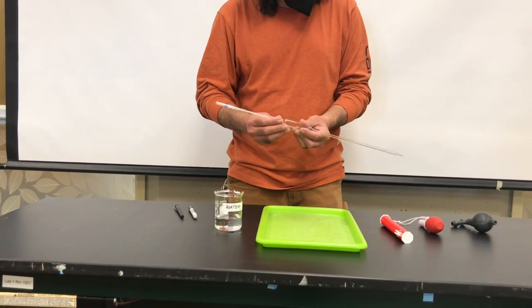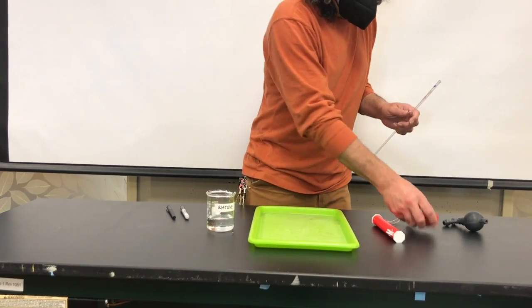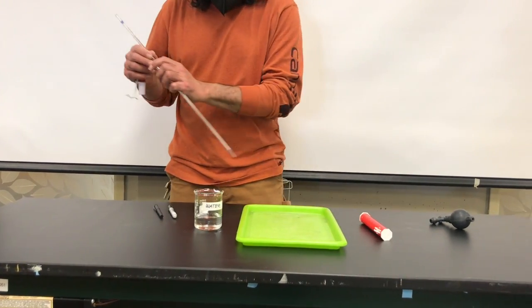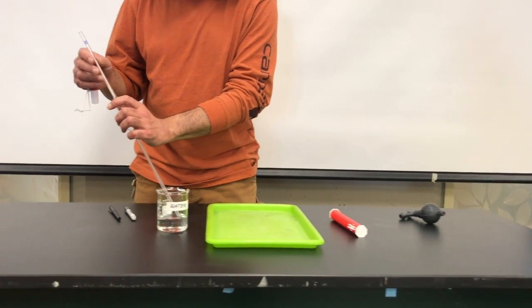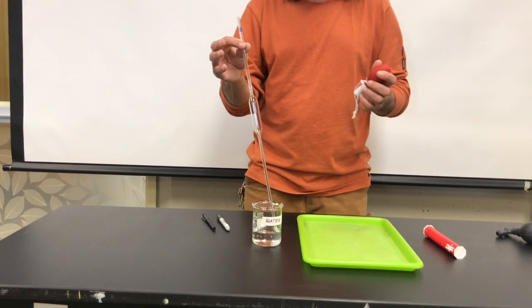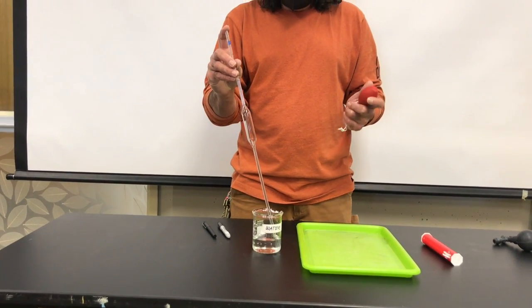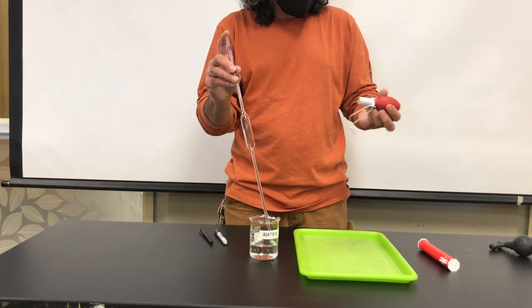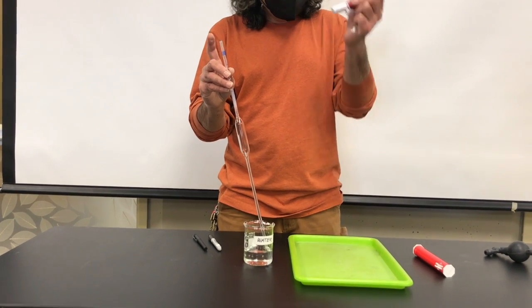To fill the pipette, you want to carefully put the tip of the pipette on your beaker with your solution. I'm right-handed, so I like using my right hand to control the flow and my left hand to control the bulb.